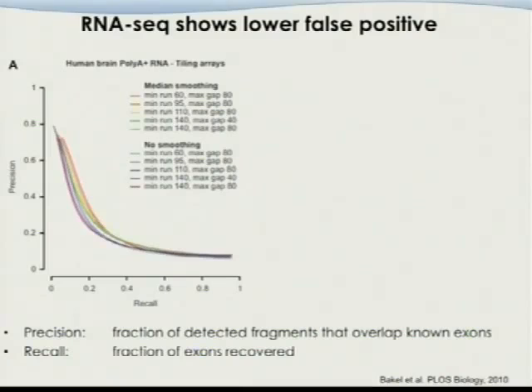All right, a couple. So basically, it's still a microarray, but what they did is they wanted to achieve the same goal as we are doing with RNA sequencing. So instead of just designing the probes to target the genes that we're interested in, they target the entire genome. You can think of it as they design probes of 25 base pairs, and every 35 base pairs they put a 25 base pair probe in there, regardless of whether we know there's a gene there or not. Of course, we only target the parts that are not repetitive regions, which is half of the genome.